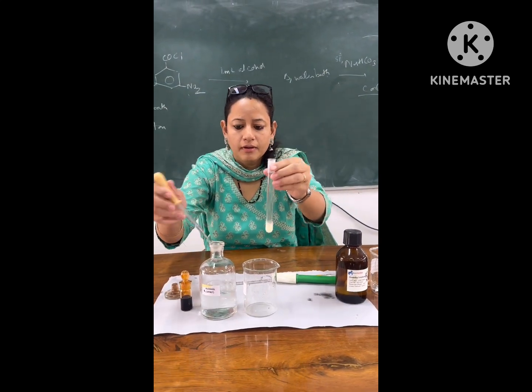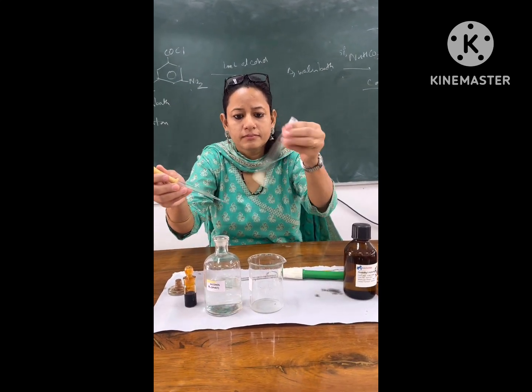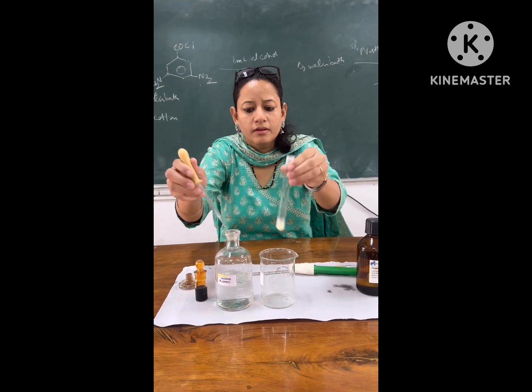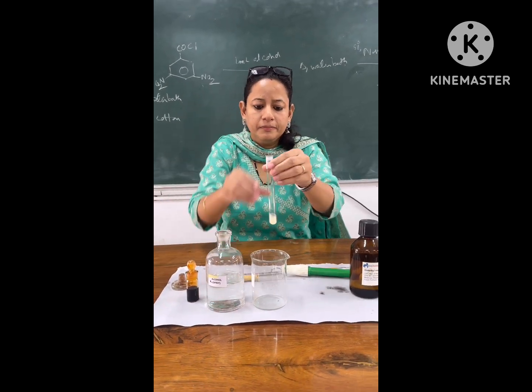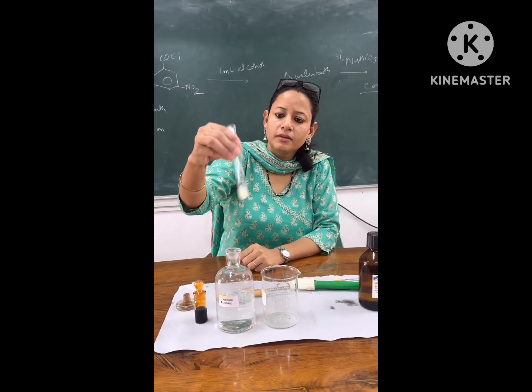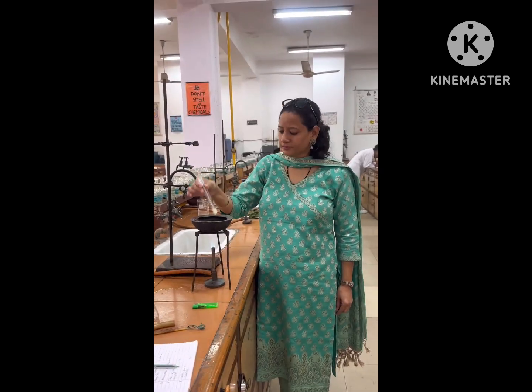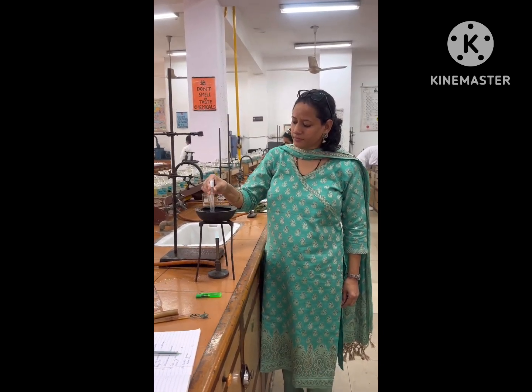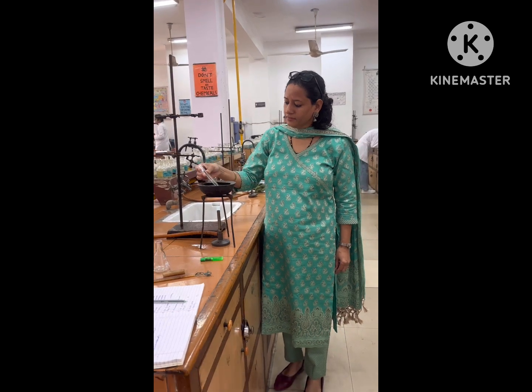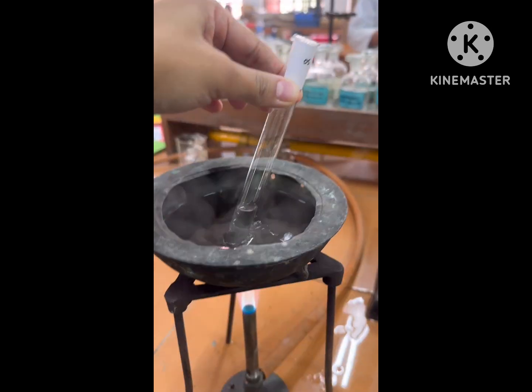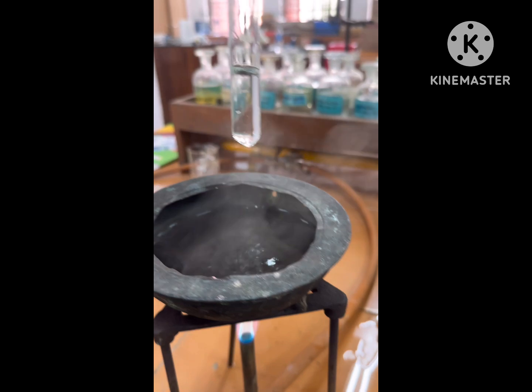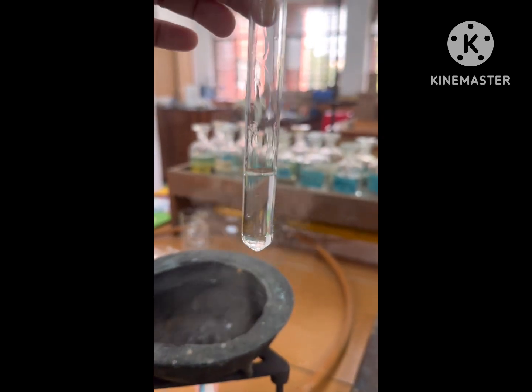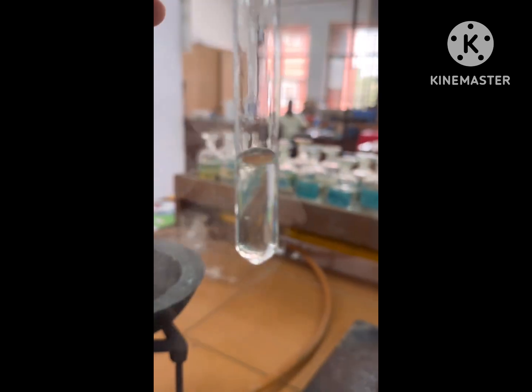Now we add ethanol to this dimethyl fumarate for recrystallization. Ethanol is added to it and then it is heated on a water bath till all the solid dissolves. Now you can see all the solid has dissolved in the hot alcoholic solution.